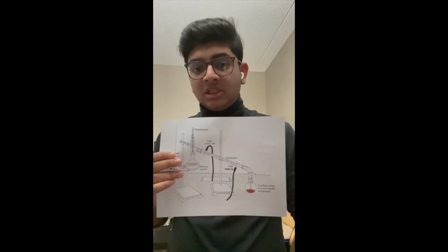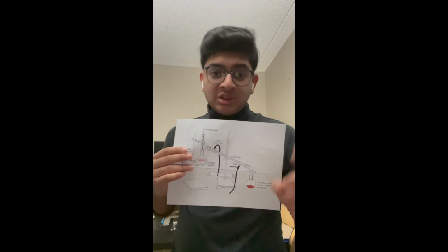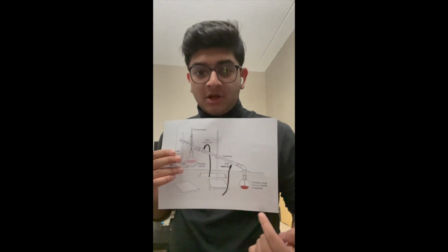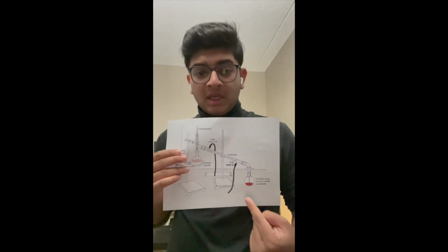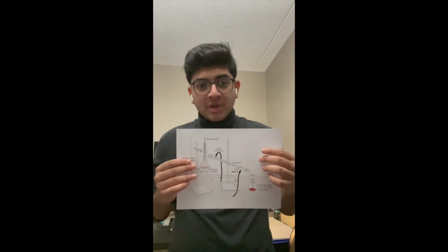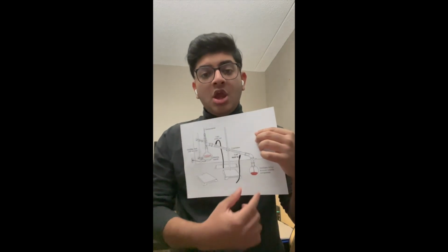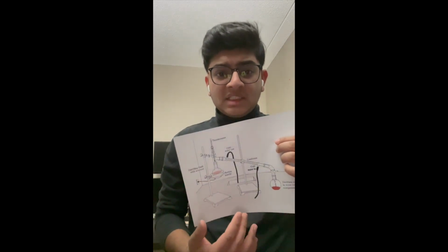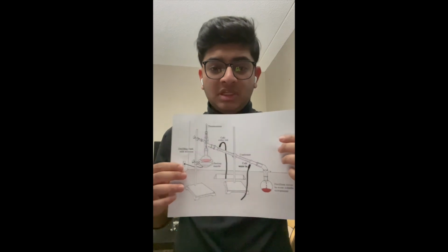We put another vessel, because now we know that the liquid A, which had the lower boiling point, is going to come out of the side arm. Now we let the receiving flask collect our unknown liquid A until the temperature varies significantly, that is, by more than 5 degrees Celsius. When that starts to happen, we remove our receiving flask and put another one in place, because now we know that whatever is going to come out of our side arm is not the liquid that we desire.